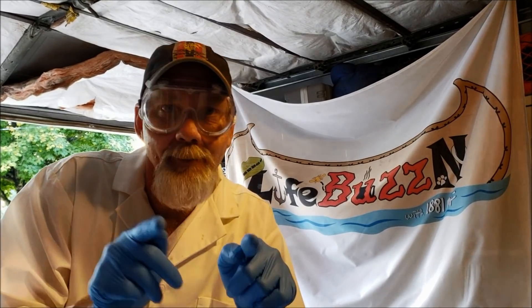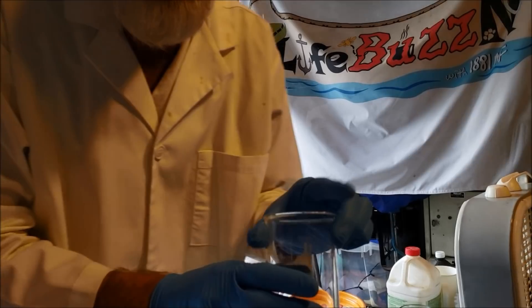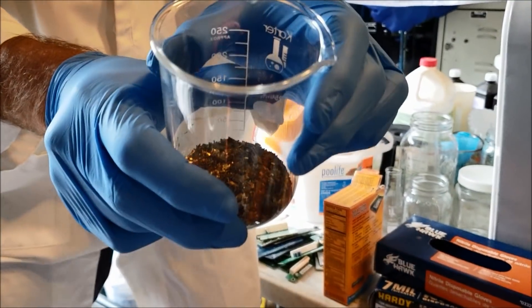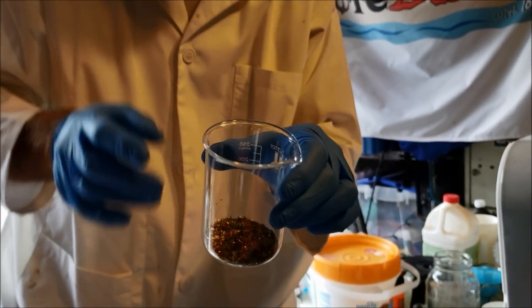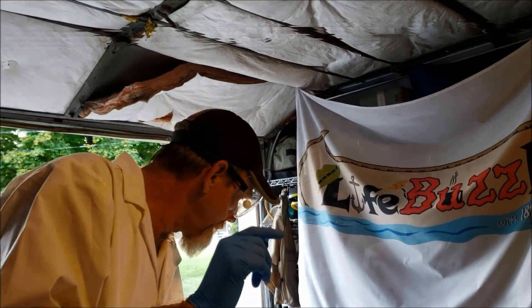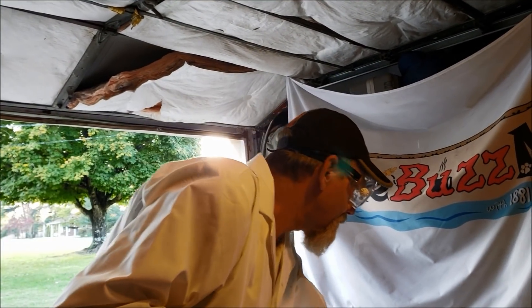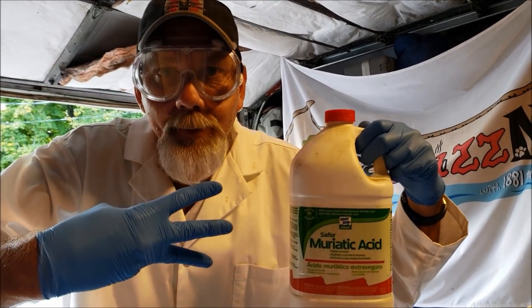So this is how you make aqua regia. I have some gold from memory chips that I've been saving that I just kind of took off with AP — maybe another video. To do aqua regia, you need three parts of hydrochloric acid — muriatic acid works perfect — three parts.